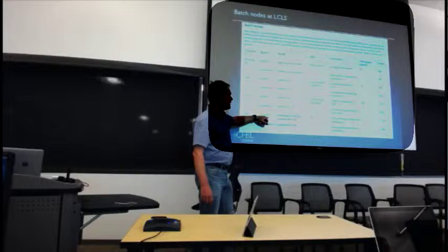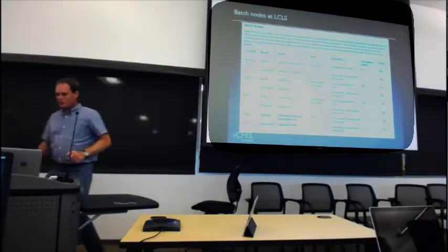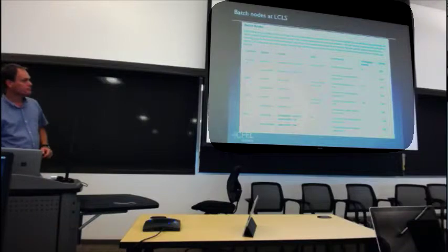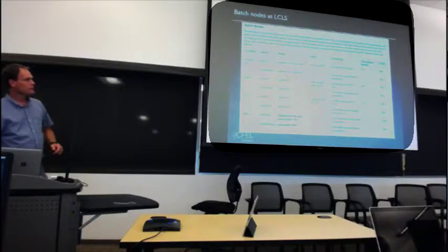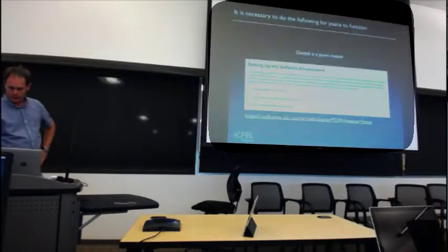Nodes are limited, so a nasty thing to do to someone is you notice your competitor's doing an experiment, so you launch a big compute job the day the experiment starts, and it shoots up all the resources. Yeah, we try to avoid that sort of thing as much as possible. But you kind of end up finding your way around this background here.